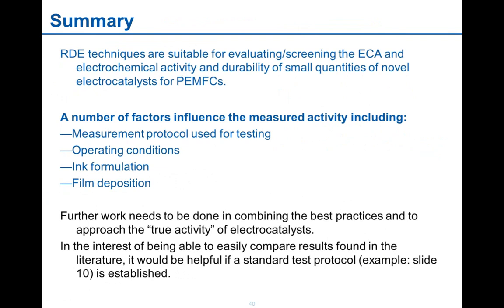I won't summarize the entire presentation, but I just wanted to point out that RDE techniques are obviously useful for evaluating and screening the ECA and activity and durability of very small quantities of catalysts. A whole bunch of factors, including the protocol, affect the measured activity. Between labs, we don't exactly have a standardized protocol, so sometimes it's very difficult to compare results between labs or while you're reading the literature. So further work needs to be done combining the best practices.